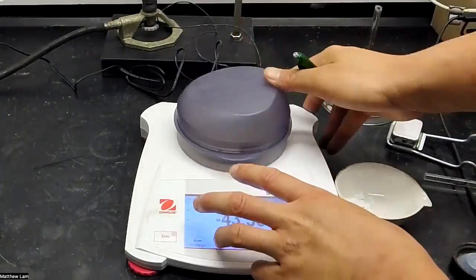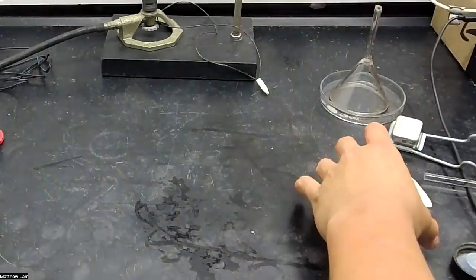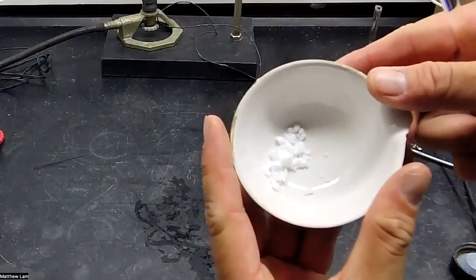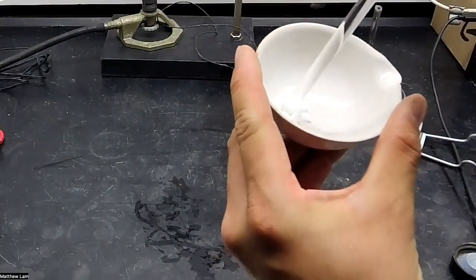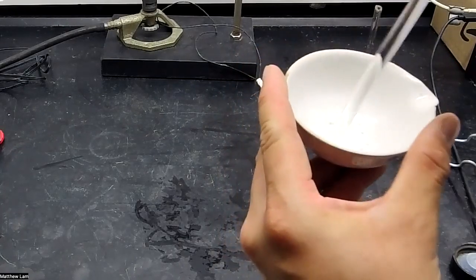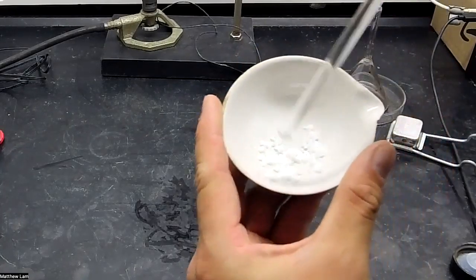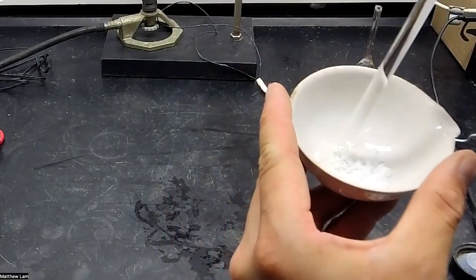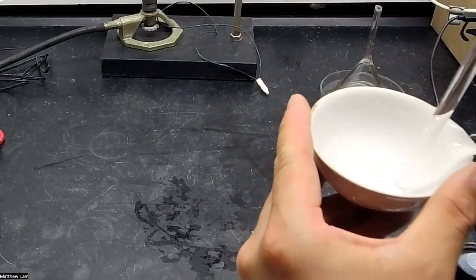And so before we even start the experiment, what I like to do and what makes it easier is I like to take this ammonium chloride because it looks kind of clumpy right now. I will take a glass stir rod and I'll kind of press it down a little and spread it out just so it's a little less clumpy.